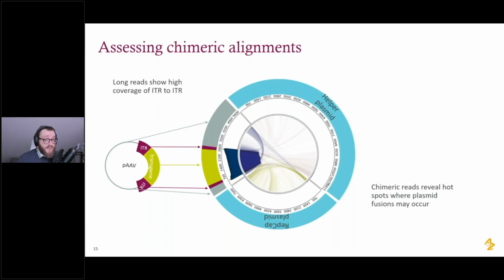Minimap doesn't deal with circular alignments, so it will flag the alignment as a chimera. This is completely normal. If you see chimeric alignments that are on the 5 or 3 prime end of one of the references and end up on the inverse, that is to be expected.